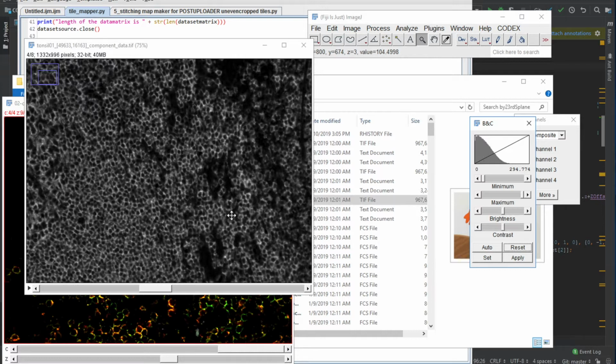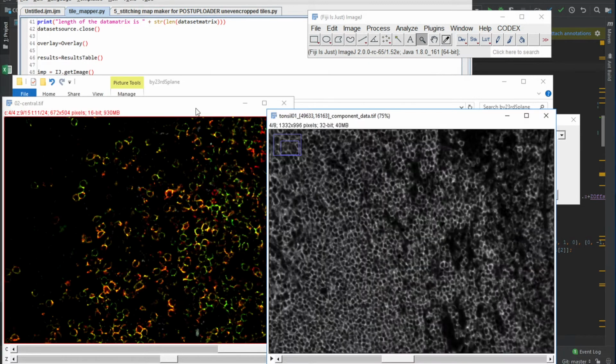And Codex software does three-dimensional segmentation. It needs several z-planes, and we usually have a multi-frame file. I'll show an example in a sec. But we will try to convert it into a multi-channel, single-frame, multi-z file, sort of artificially trying to cheat the Codex software. So first of all, I just want to show our regular data that we have for Codex.